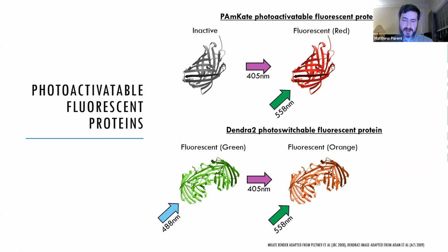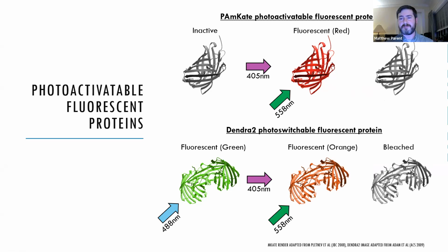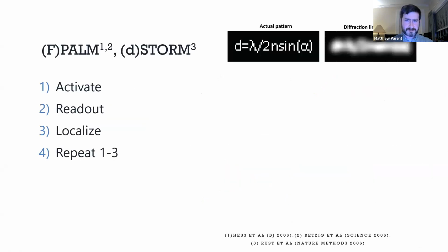And if you hit them hard enough or for long enough, these will eventually bleach and then you won't see them again. So these are sort of essential to PALM, FPALM, and the way that that works.